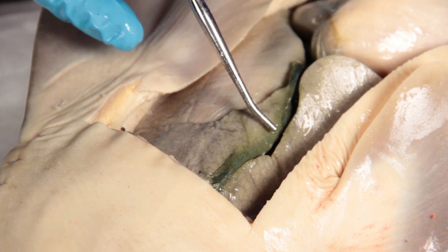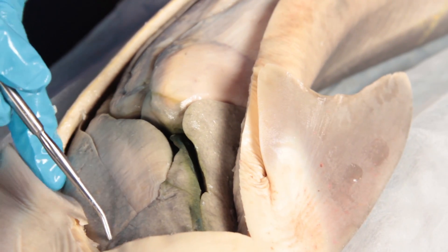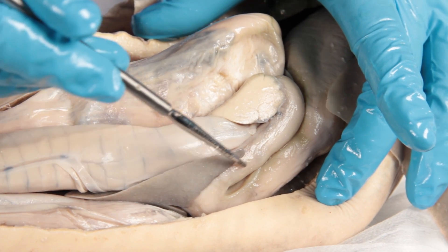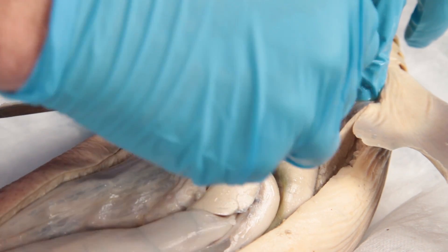Identify the following internal organs: liver, stomach, and small intestine. Next, open the stomach and observe the interior structure.